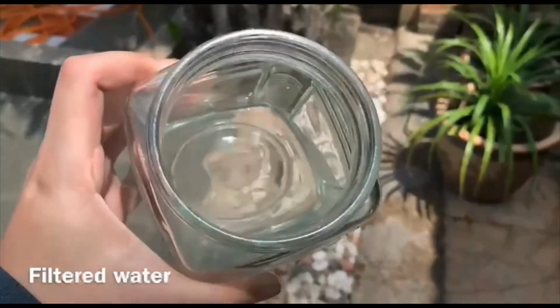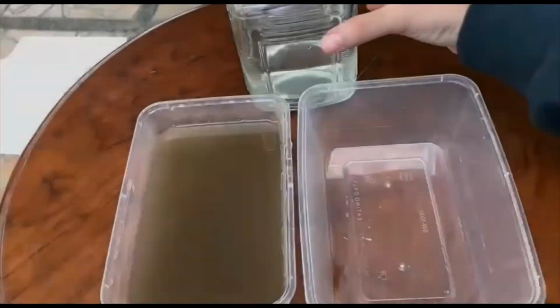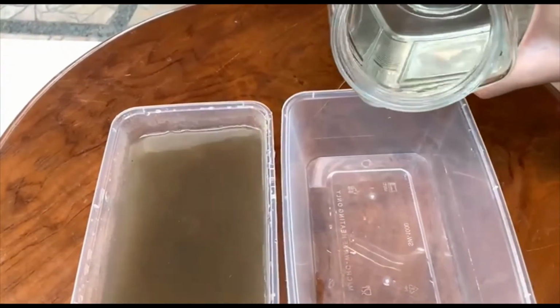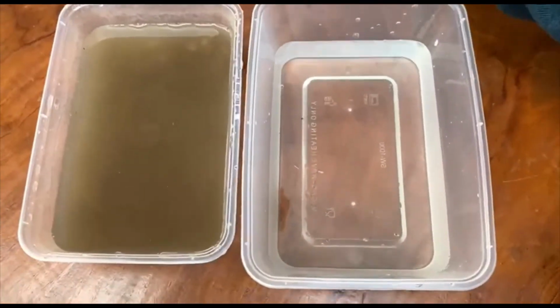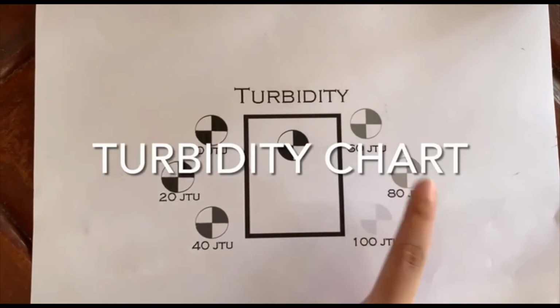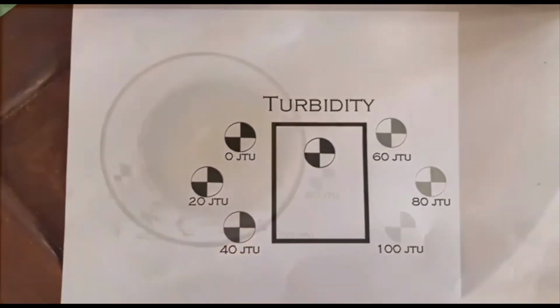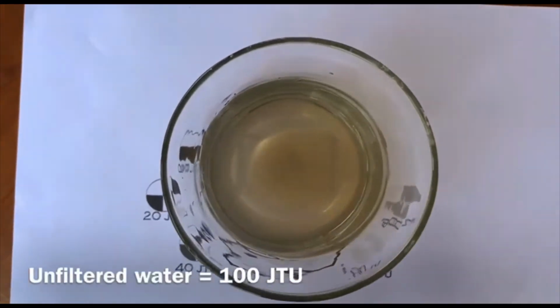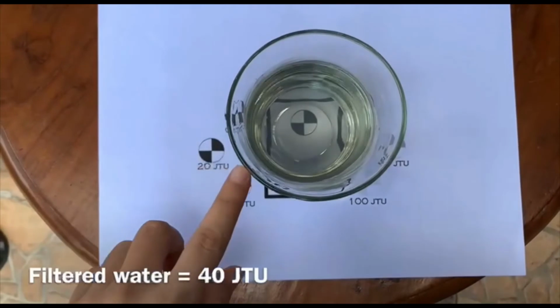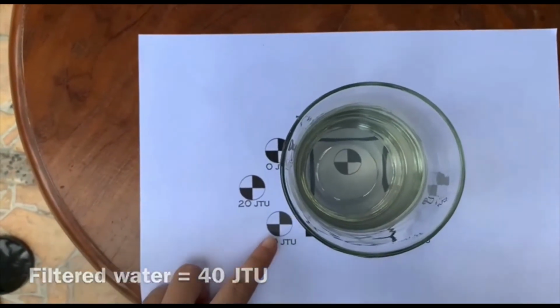So here is the filtered water from the water filtration. And for the physical parameters, I'm using a turbidity chart to measure the turbidity of the water. Here is the result for the unfiltered water, which is 100 JTU. And here is the result for the filtered water, which is 40 JTU only.